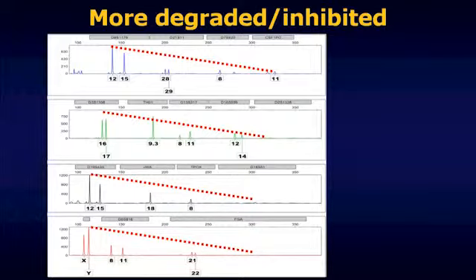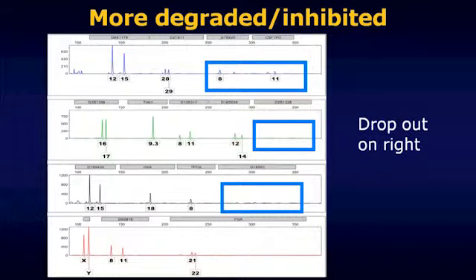And look what can happen when degradation and inhibition play out. In a word, we can have this phenomenon known as allelic dropout take place. No DNA analyst wants to see indications of allelic dropout. Allelic dropout quite simply means that the test has failed. It hasn't given us the information that we had hoped it would give us for at least some parts of the DNA, the loci that are being tested by the kit that's being used. We're getting an incomplete picture of the actual DNA profile when dropout has occurred.